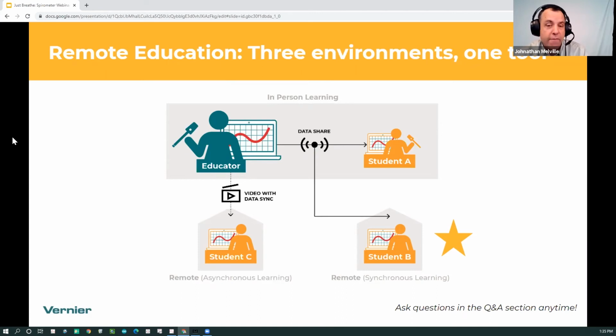The issue is you do not have access to that adjusted volume channel, and there is no way to control for baseline drift like there is in Logger Pro. So it's really important that you zero it and hold it directly upright.